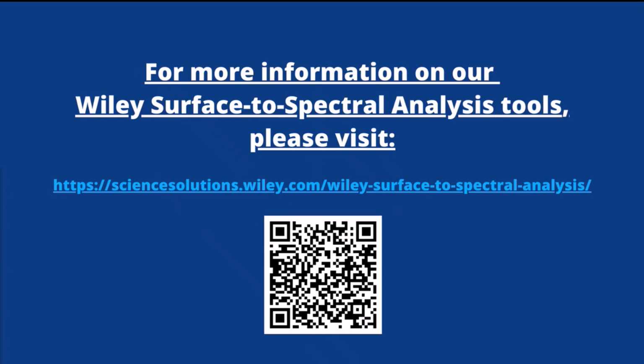Some other good ones coming in here. Here's a good compatibility question. Can I run Surface to Spectra on a Linux system or a Mac? It runs on Microsoft Windows at this point in time. Thank you for that clarification, Dr. Liana. All right, we have some time for a few more.